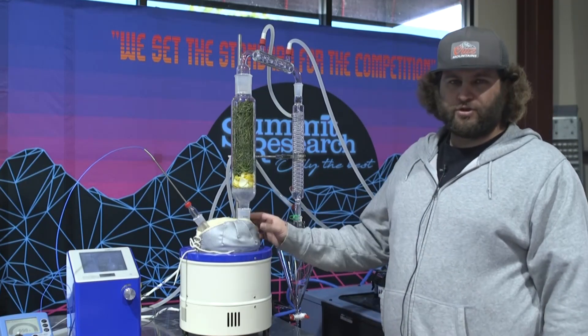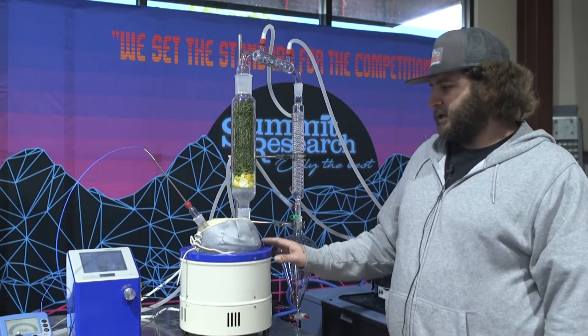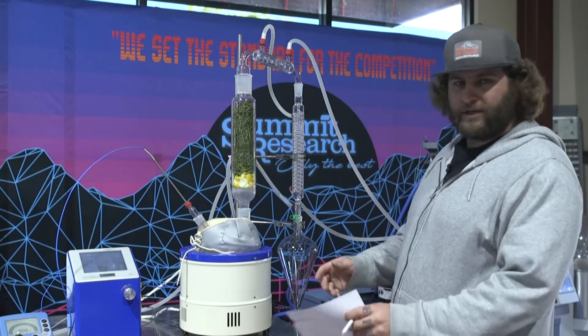A couple different things — you have options. You can run it with a cheaper mantle. In our case, we're going to run it with a Techno Heat because we like our Techno Heat mantle the most.